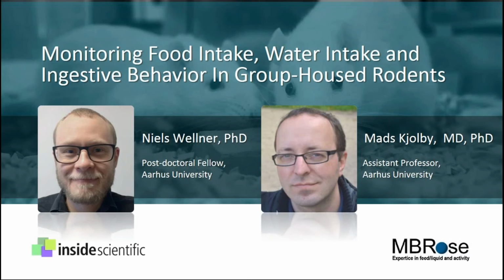In today's webinar, our presenters will discuss methodology, best practices, and provide guidelines for implementing a real-time food and water intake protocol using group-housed rodents. Focus will be on study setup and data collection of water intake, meal size, frequency, and duration. Examples will be provided of acute intervention studies like the leptin test, as well as longer-running experiments. Methods and data will also be shown from an ethanol preference test in mice.